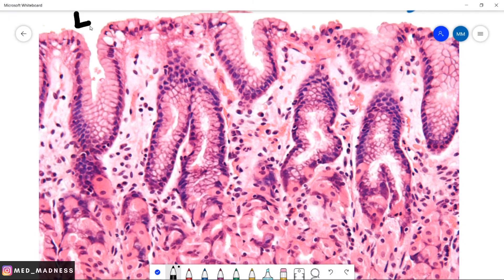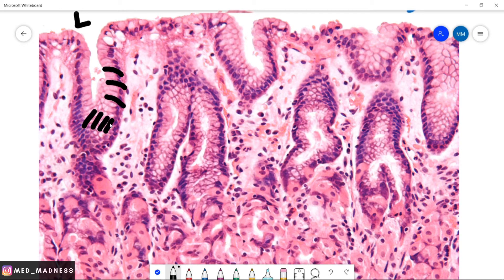Now let us go over the histology slide. This is the lumen of a stomach. Here you have the epithelial cells. Note the type of epithelial cells here — this is tall columnar cells. Tall columnar cells whose main function is absorption or secretion. In the esophagus or anal canal, you can see stratified squamous epithelium, which means many layers of squamous cells that helps with protection. In the stomach or intestine, you have the columnar cells because their main function is absorption or secretion.